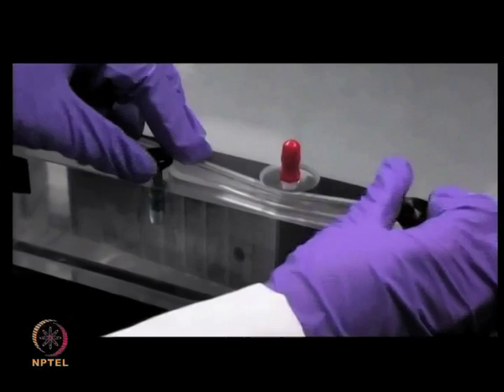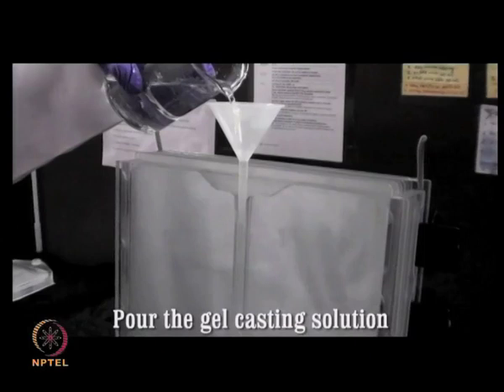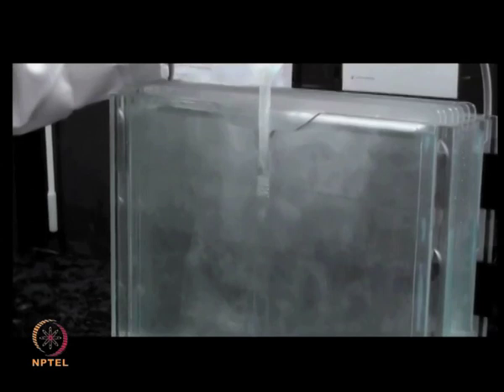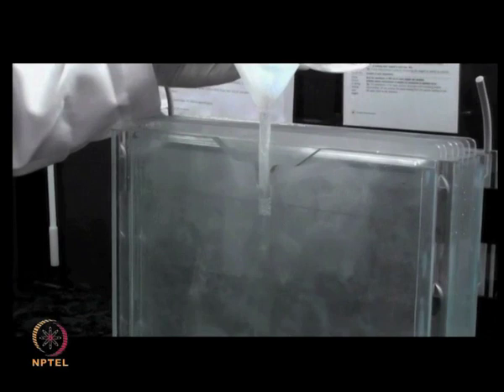Prepare the gel casting solution consisting of acrylamide-bisacrylamide, tris chloride, SDS, APS, and TEMED, and pour it with the help of a funnel into the central channel of the casting assembly. APS acts as a free radical generator while TEMED functions as a catalyst for the polymerization reaction.